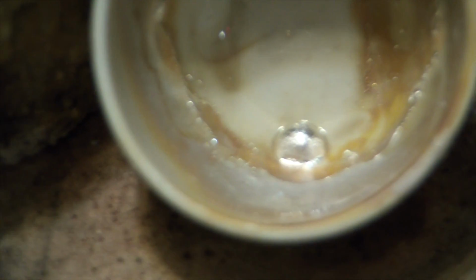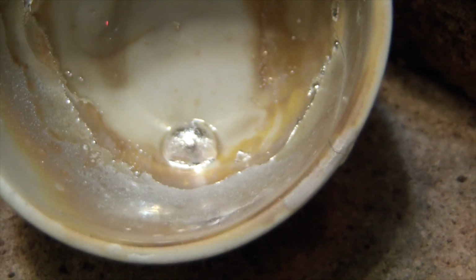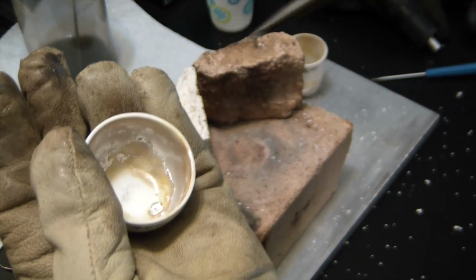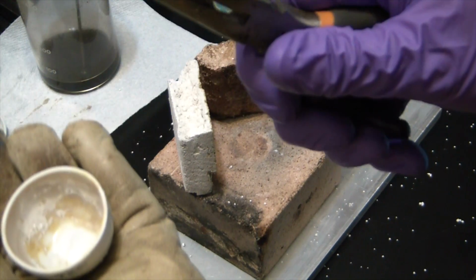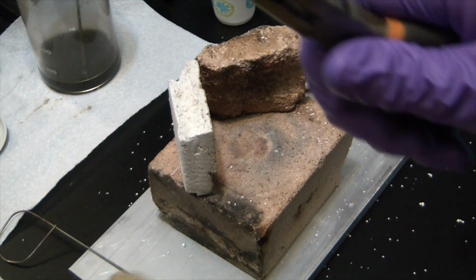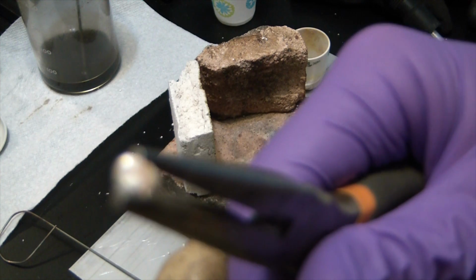Focus. There we go. Nice ball of silver. Finally. I'm going to try to remove the bead. And it took some of the ceramic off with it.